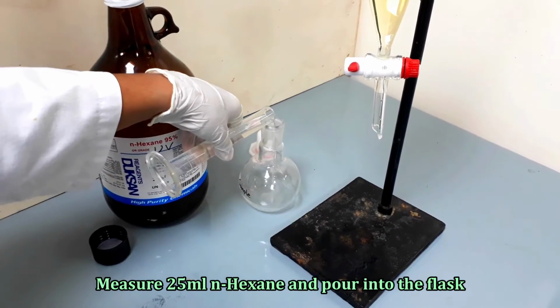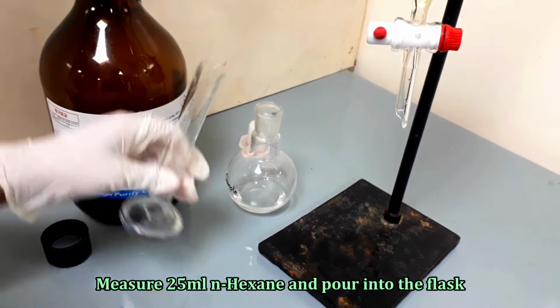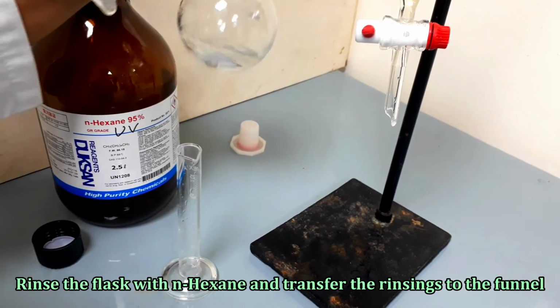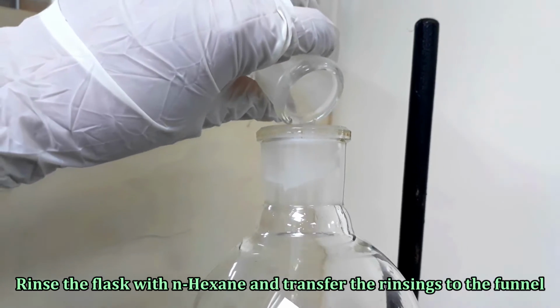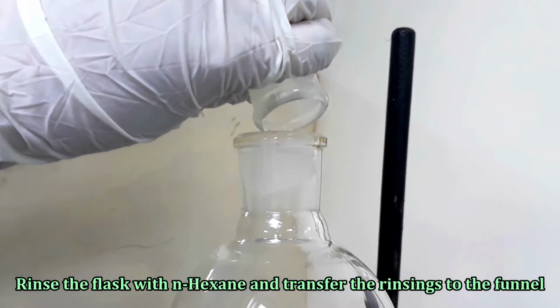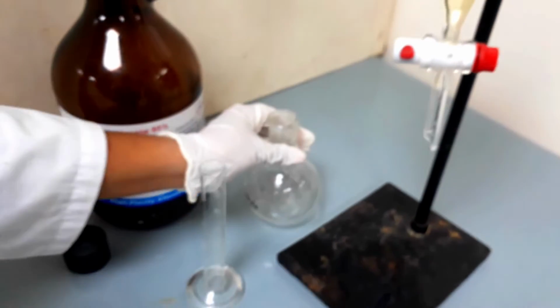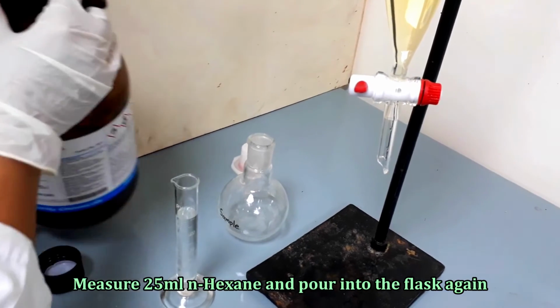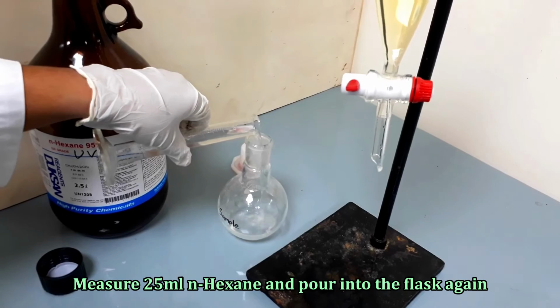Now wash the flask with n-hexane and transfer the washings into the separating funnel. Wash the flask with n-hexane again in the same way.